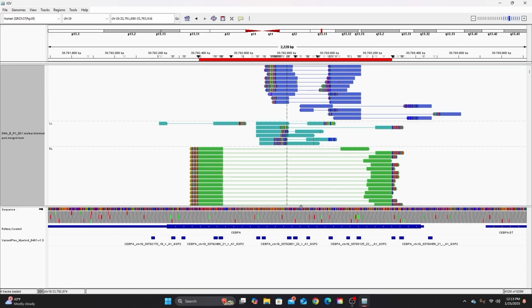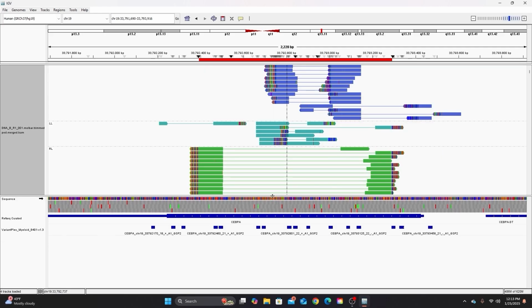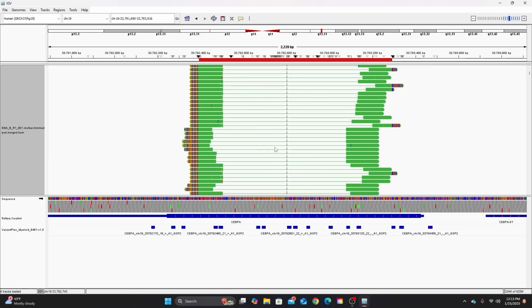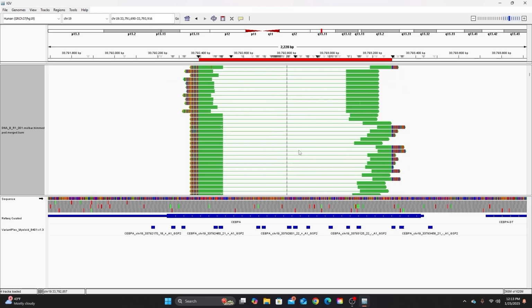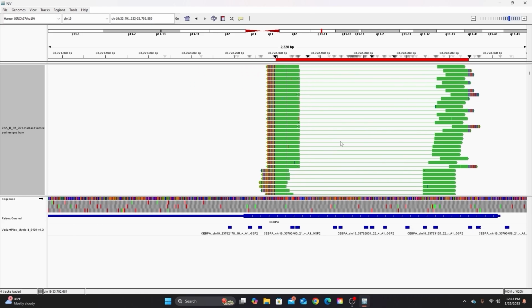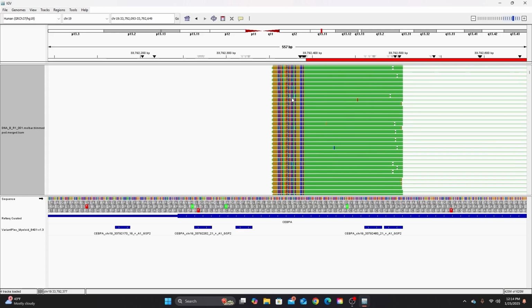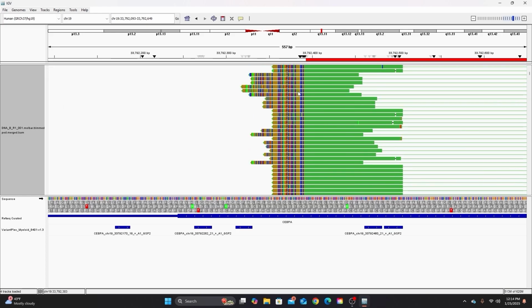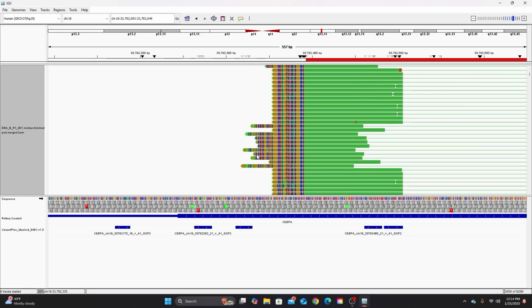All right, so I'm making some space for new tracks here. And I'm going to start with the low-hanging fruit. So I'm going to start with the piece that has the most support, right? So let's take one of these longer soft clip bases, and let's actually zoom in a little. So these all look well aligned with each other again, right? Based on the color coding. So I'm going to choose a soft clip base that seems fairly representative of the rest, and also kind of on the longer side, maybe see where it belongs.